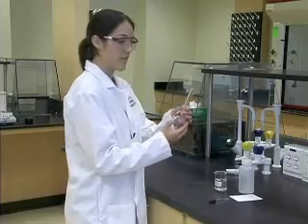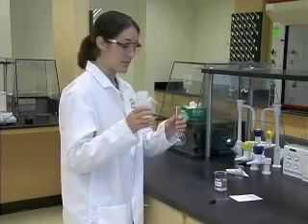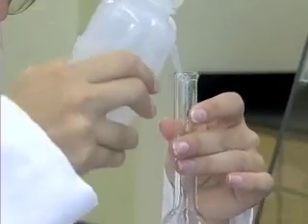You will then want to make sure that the solid is removed from the neck of the volumetric flask as well. So using your deionized water, you will want to rotate the volumetric flask to ensure that all of the solid is in the bulb portion.